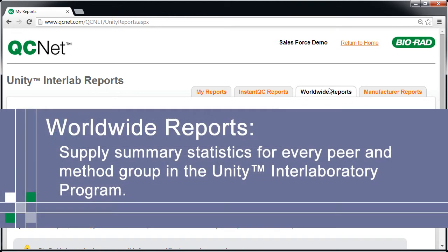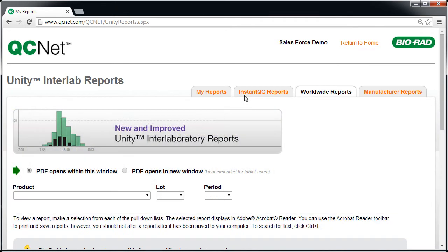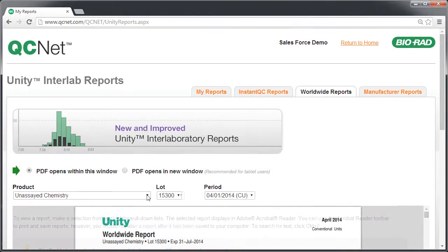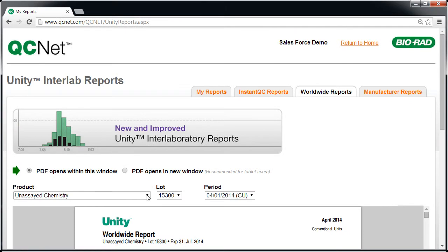Worldwide reports supply summary statistics for every peer and method group in the Unity Interlaboratory program. Many customers find this helpful when switching to a new control or lot.